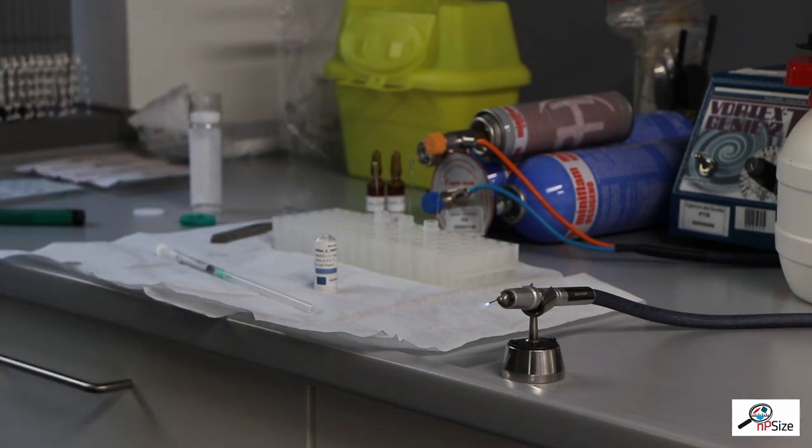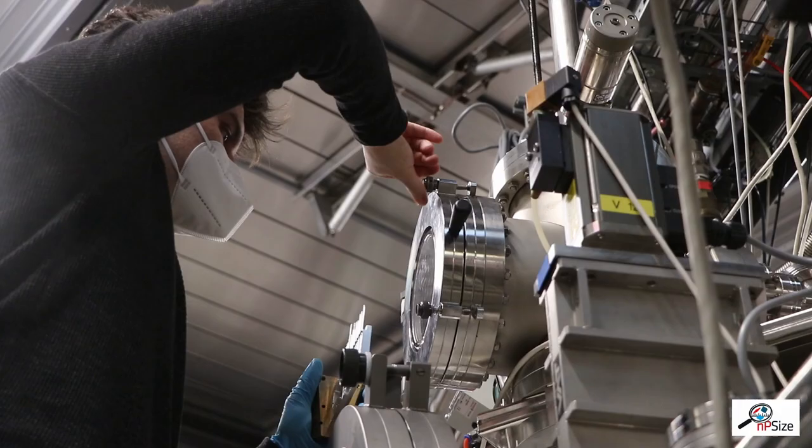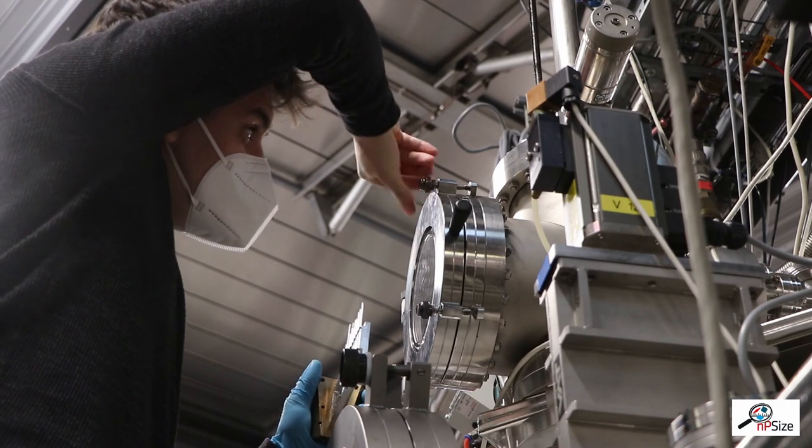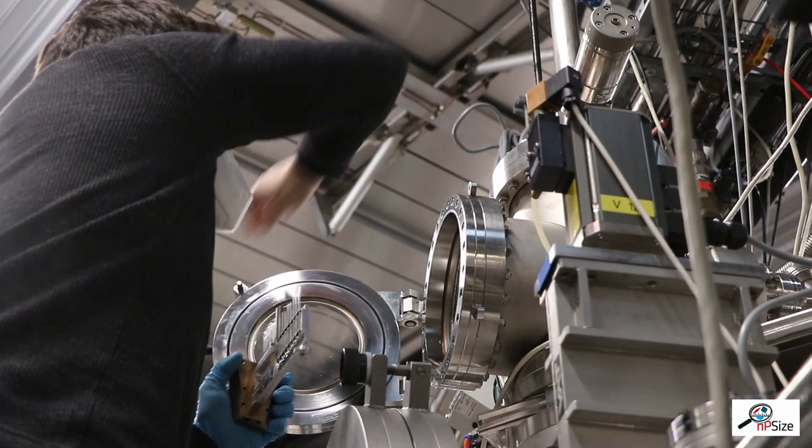These capillaries are then stored in a holder together with standard samples which are used to calibrate the instrument. This holder is then transferred into the sample chamber with the help of a vacuum lock.